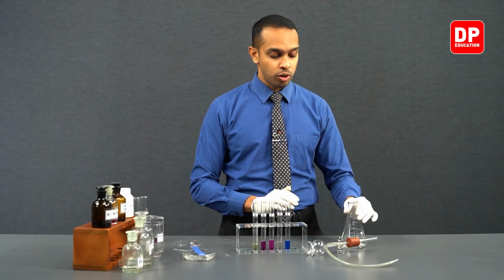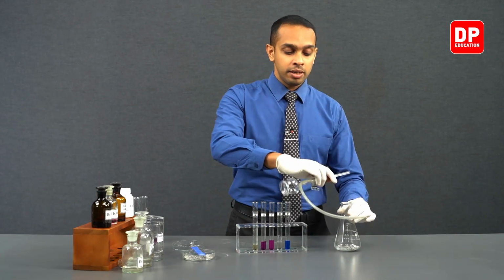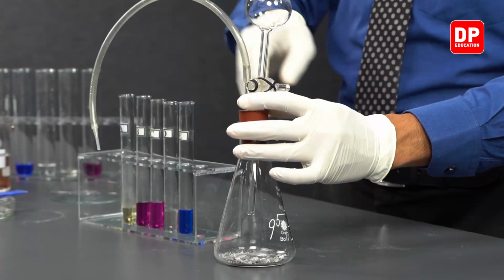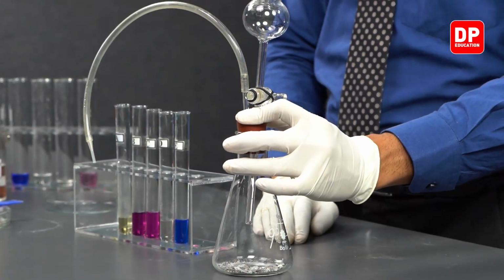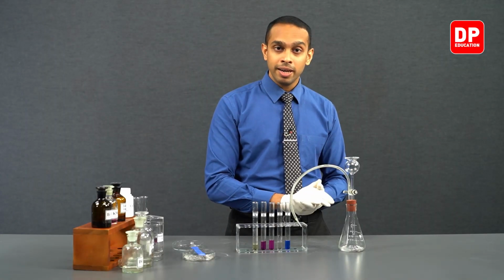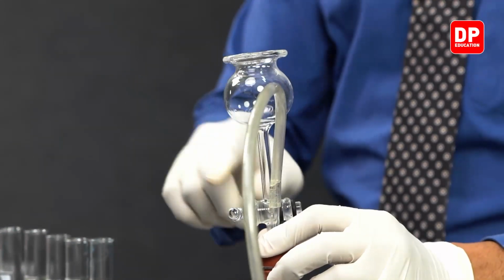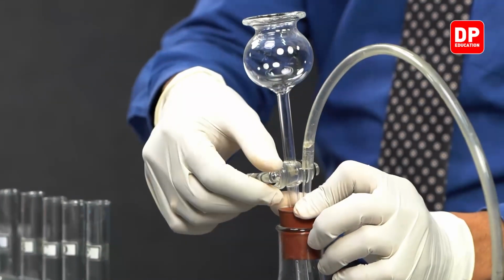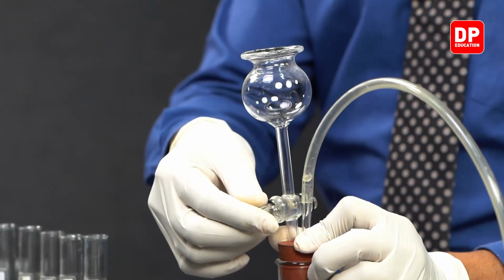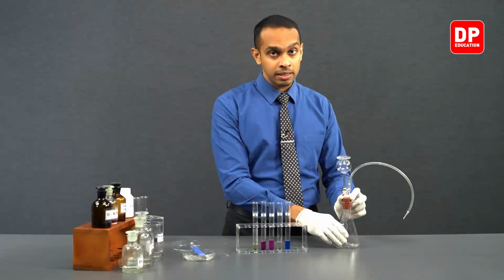After we have added a small amount of calcium carbide into our conical flask here, we can go ahead and seal the container with the rubber stopper like so. When we are adding water to calcium carbide, we are going to be using the Thistle funnel we have here. In the Thistle funnel, we have a small valve here.